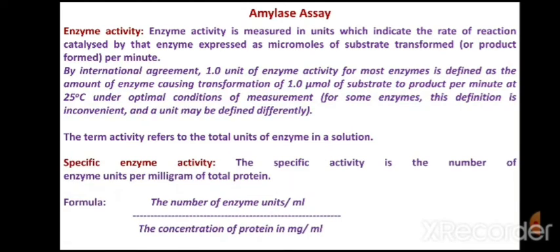There is another term called specific activity or specific enzyme activity. Why is it called specific? Because you have a solution, and in that solution there is your enzyme, and along with that enzyme there may be several other proteins.